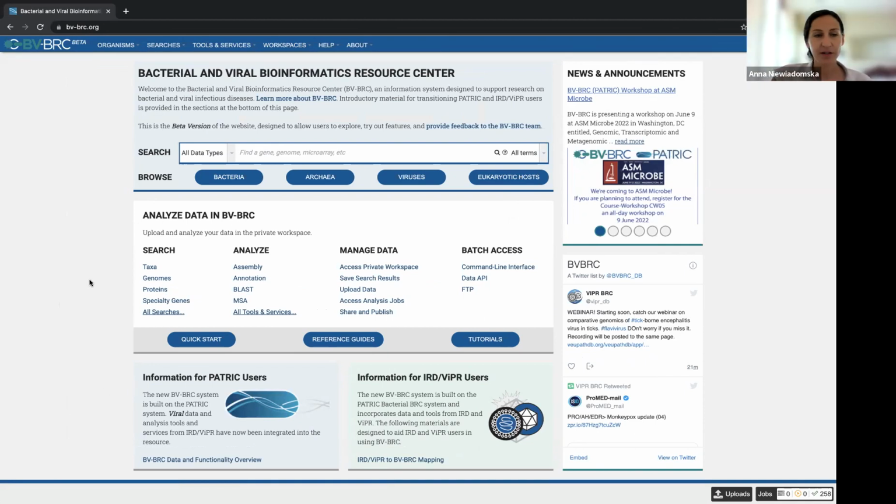If you haven't used the BV-BRC website before, it's pretty easy to get to: bv-brc.org. As I mentioned, you can find all kinds of data and information on both bacteria and viruses. And we do also provide information on archaea, but that's not today's topic.